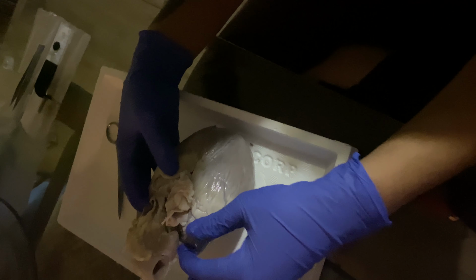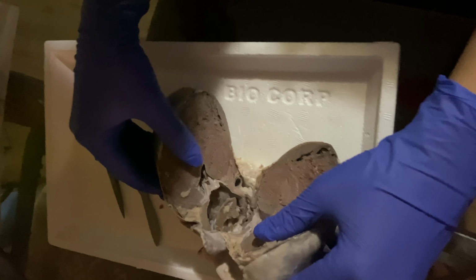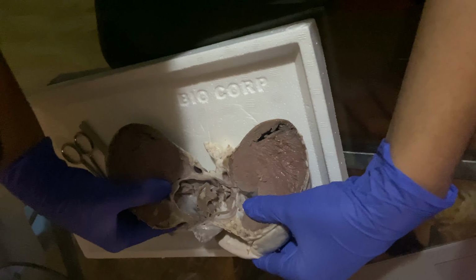And you also notice here that this has been dissected. This is the pulmonary trunk. That way you get to see the pulmonary valve. And then you have a frontal cut to open it up, to be able to see the four chambers and the anatomy inside, just like you would see it in a textbook.